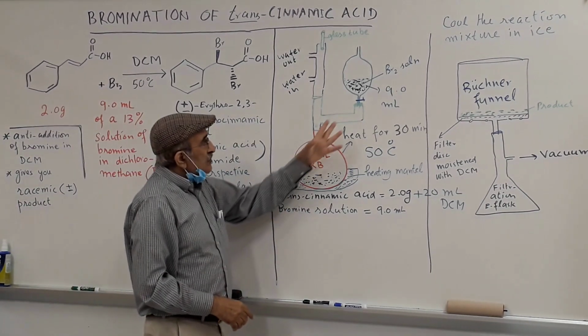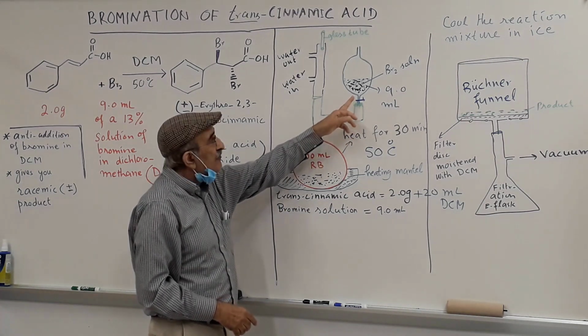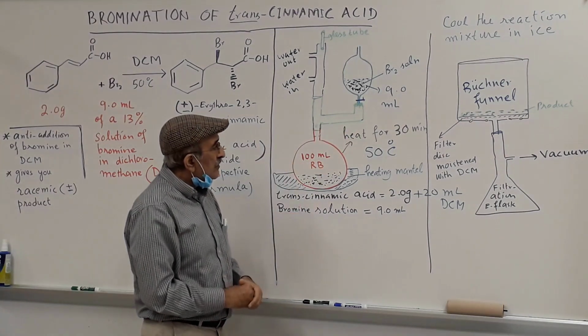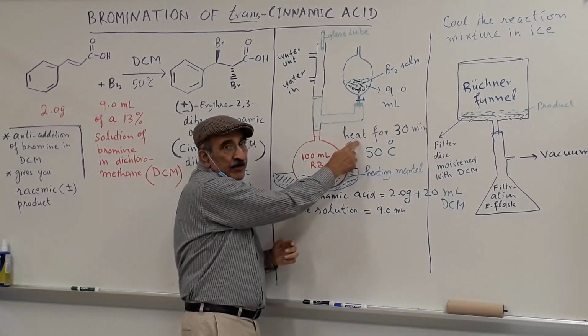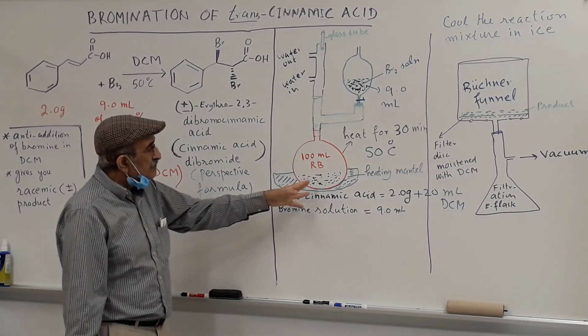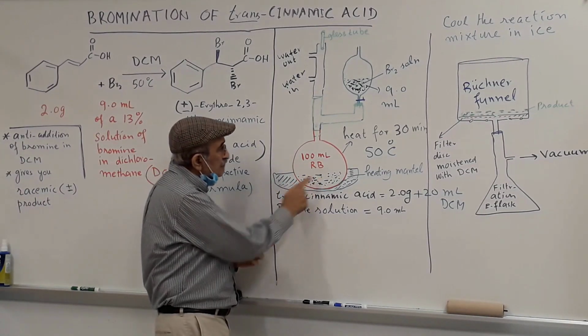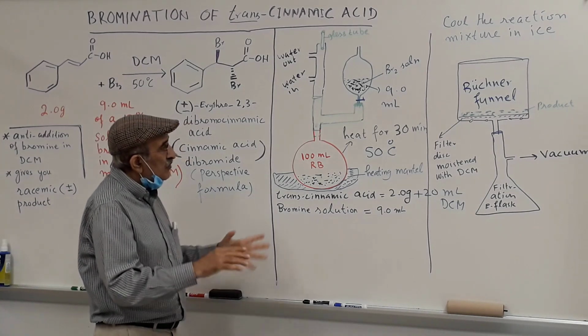Okay. So you should take about 4 or 5 minutes adding 9 ml of bromine, and at that time you actually start counting the 30 minutes from there. And after 30 minutes, you should see a white precipitate visibly inside the flask. Okay, so your experiment is done.